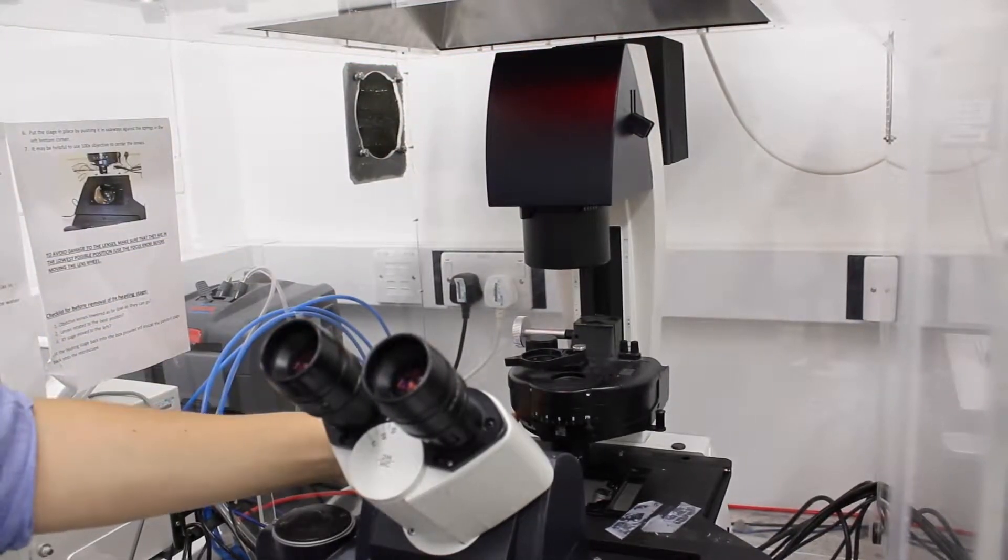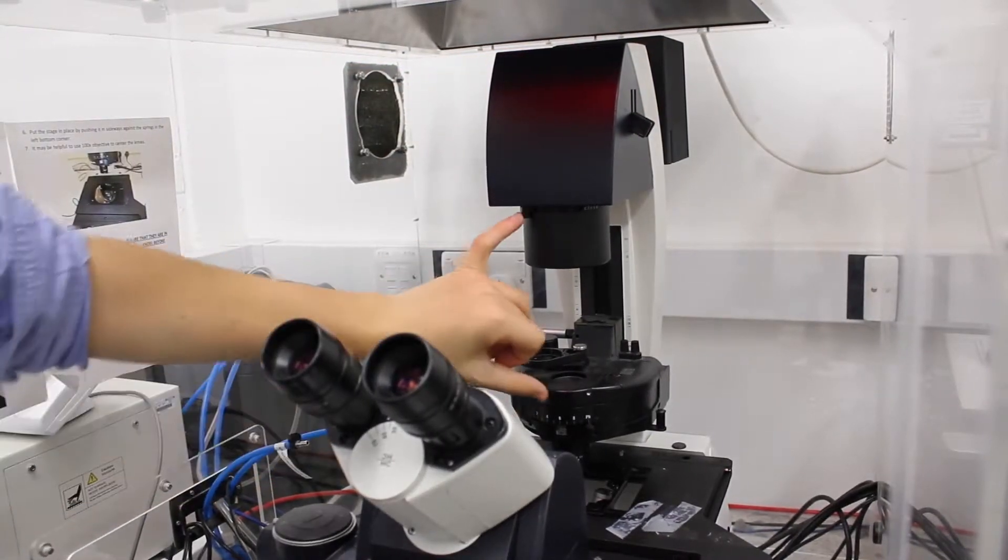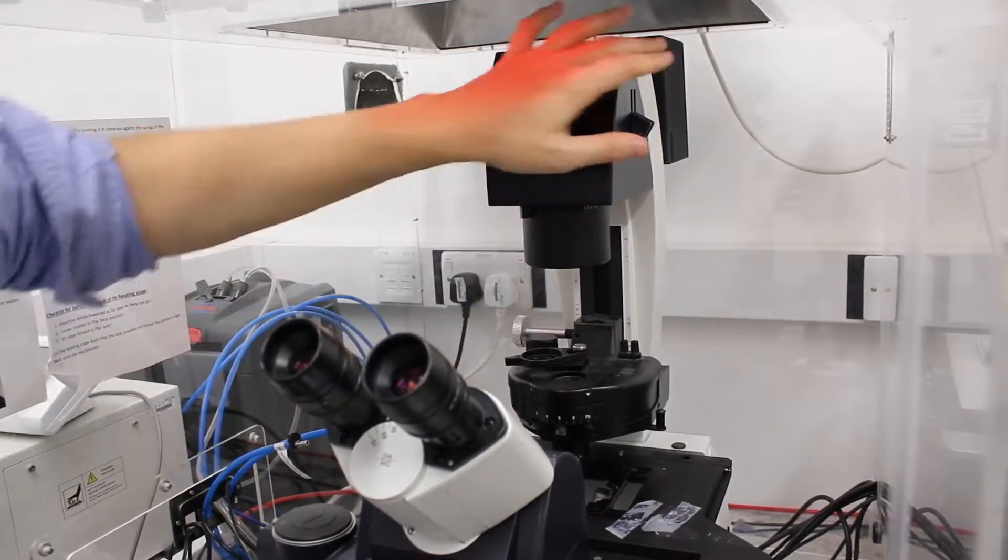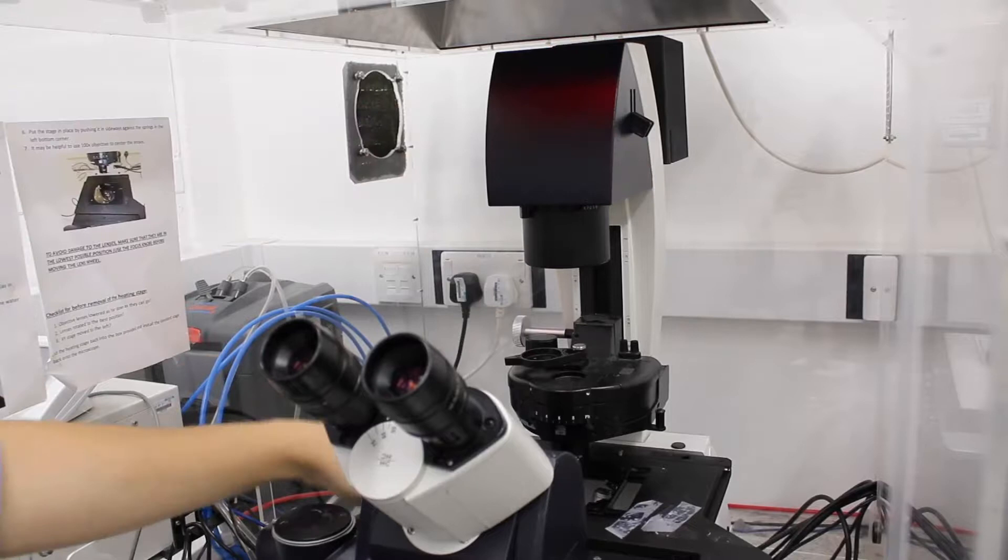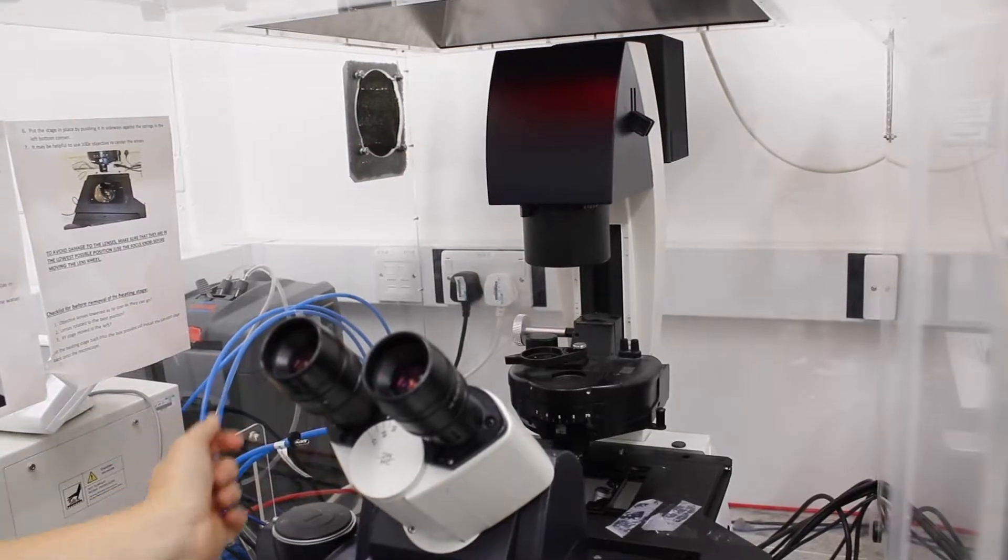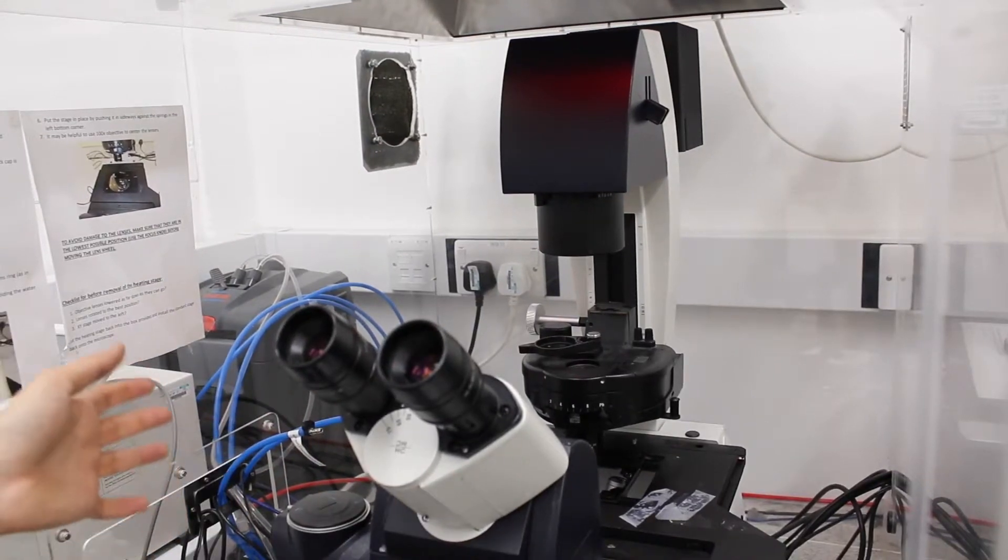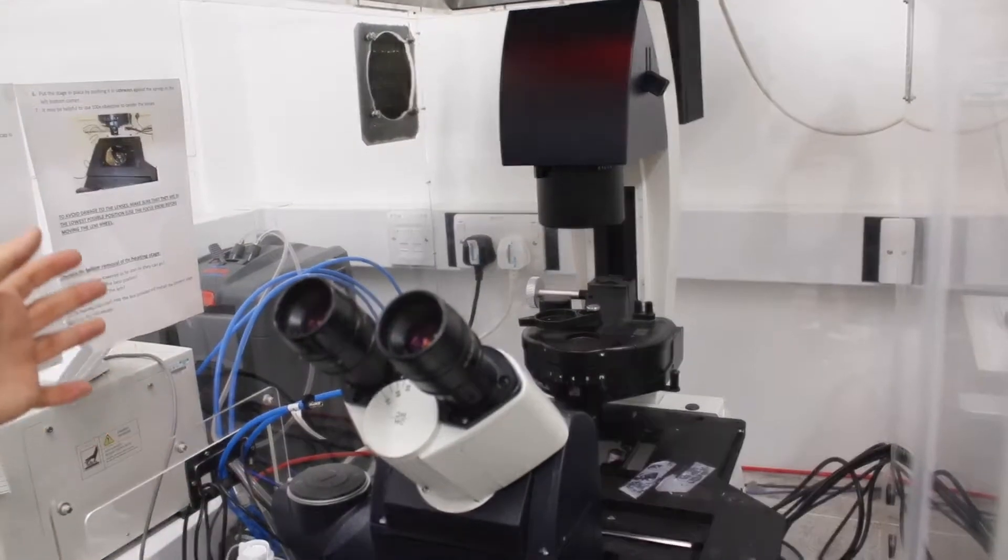So you've checked that you're on Brightfield mode, you have both diaphragms open, you have the light going to the sample, and then you can load your sample.